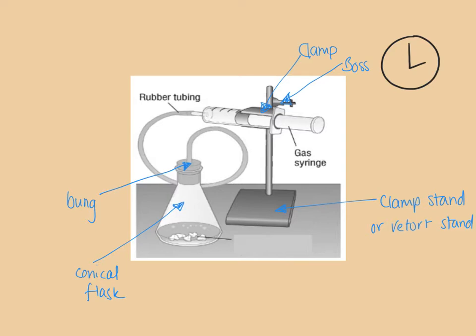And in the corner, I've got my little clip art stopwatch. So we need to measure this over time so that we know how fast it's happening. Now this particular setup is really important because this topic has required practicals, and one of the required practicals is to measure the rate of reaction and investigate how it changes when you are creating a gas. This reaction produces a gas.